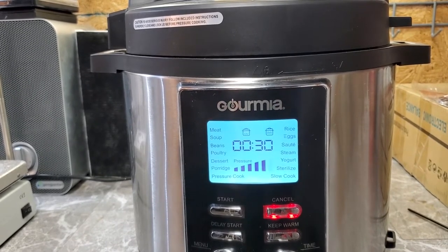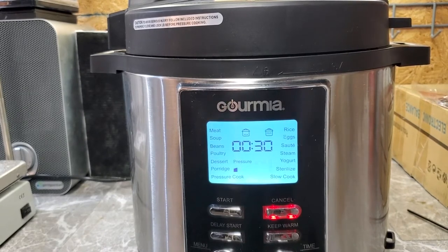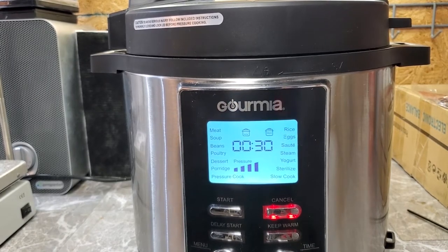Let it go until the timer goes off and let it cool down for about 10 minutes, then vent and pour into the petri dishes — which is what we'll do when this is done. I'm going to go finish watching Reservoir Dogs while this does its thing.